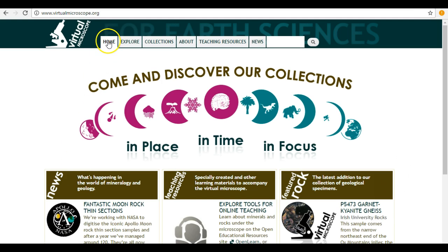Here we see the main homepage of the Virtual Microscope. At the top of the page you will find 6 different tabs: Home, Explore, Collections, About, Teaching Resources and News. More background information on the Open University Virtual Microscope can be found in the About section. The Virtual Microscope database can be accessed under the Explore and Collection tabs.